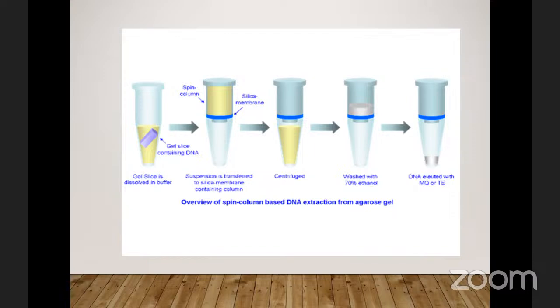Only the liquid used in lysing comes down through the gel, and the DNA or RNA sticks to the membrane. You then add other reagents to purify it, kind of wash it. In all of this, you centrifuge in between. Centrifugation allows the reagent to pass through the filter of the membrane while the nucleic acid material sticks to it. You follow this procedure until the last point where you get your pure nucleic acid material. Next slide, please.